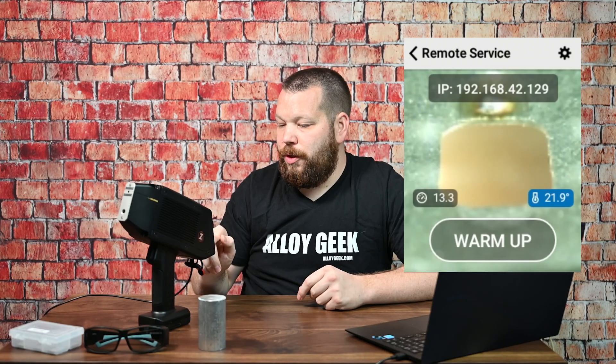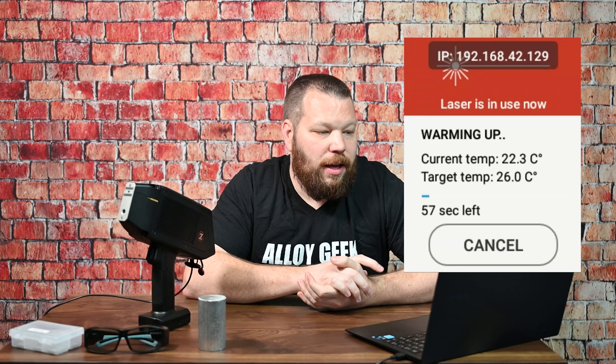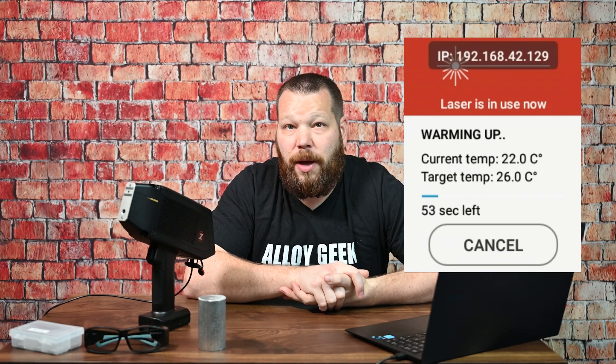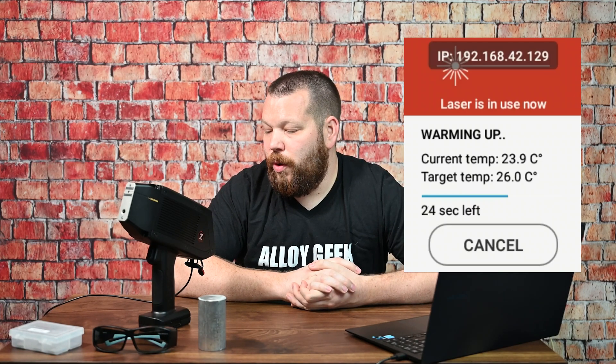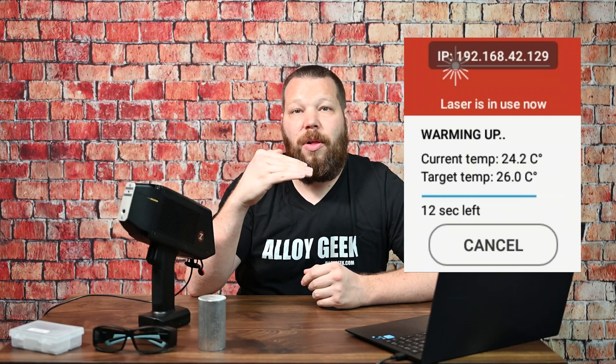We'll hit warm up on the screen. Now it says warming up — laser is now in use. So it's a great time while it's warming up to talk about safety. I have a pair of laser safety glasses here. I'm not required to wear them for this video, but you may be required to wear them based on your state regulation, local government regulation, or your company's safety culture. This is a class 3B laser. It is totally contained in the unit right now, so it is not firing outside of it. The unit is pulsing the laser internally just to heat it up. The reason you want to heat it to 26 degrees Celsius is because a stable, constant temperature is where you get your best results.